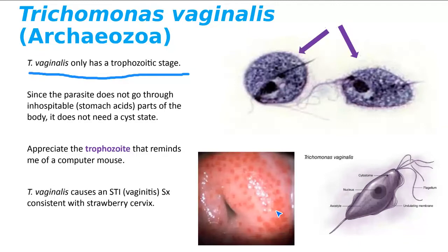I'll probably give you a hint on the practical — I'll say this looks like a mouse click-click. You're looking at an oval-shaped structure with a single nucleus, an axostyle — that's Trichomonas. It does not have a cyst state, only a trophozoitic state.